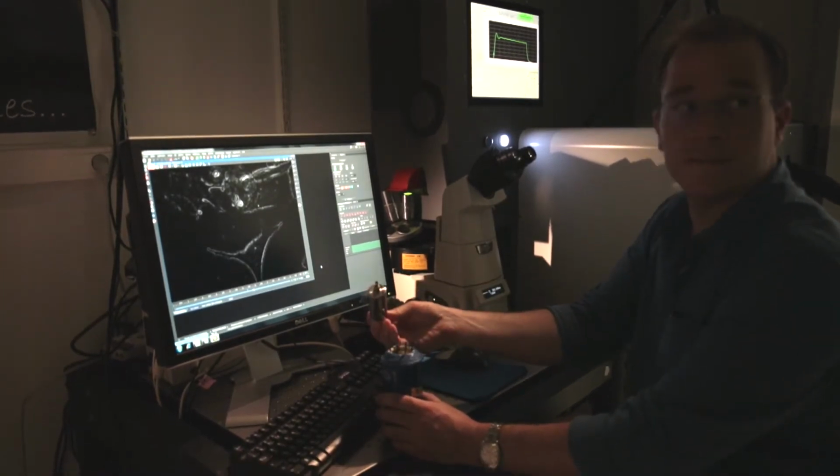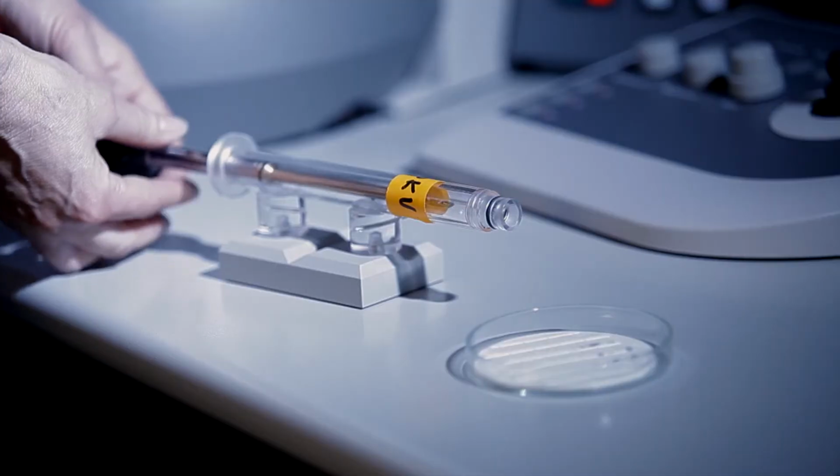Once it's high-pressure frozen, we can prepare it for electron microscopy. And using the landmarks of the CryoCapCell, we can retrieve the sample in the electron microscope to correlate the images.